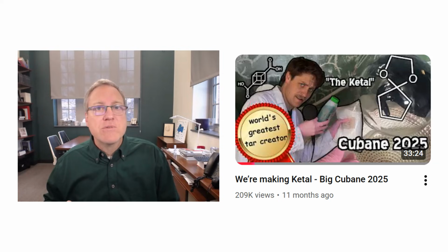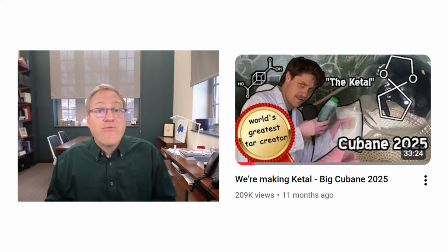This reaction is such a fundamental reaction in organic chemistry. Everybody who takes organic chemistry learns about this reaction, probably in their second semester of organic chemistry. So I'm kind of excited about this video. Throw in the fact that Extractions&Ire has some birds in this. I mean, it's got all kinds of action. So I'm looking forward to this video and I hope you enjoy it.